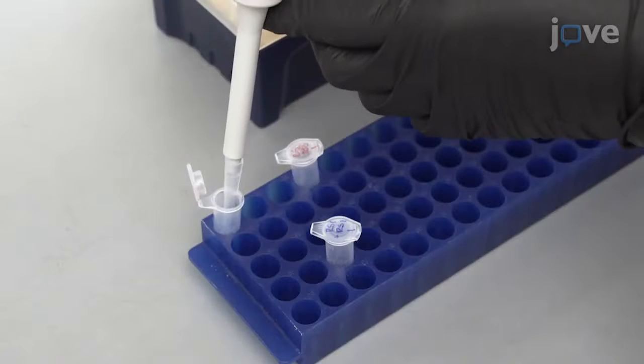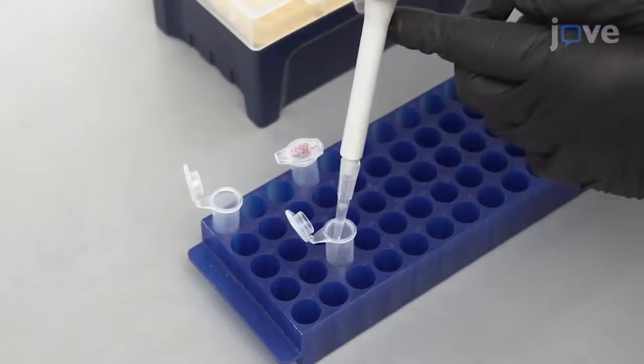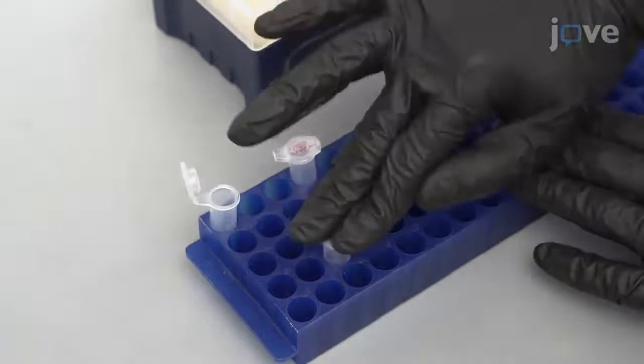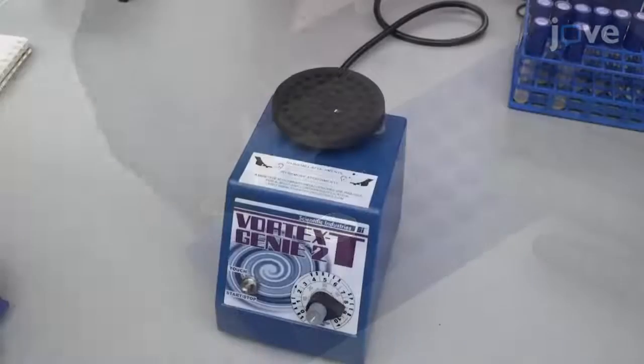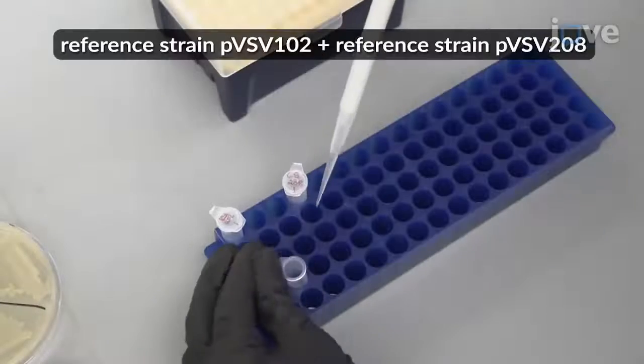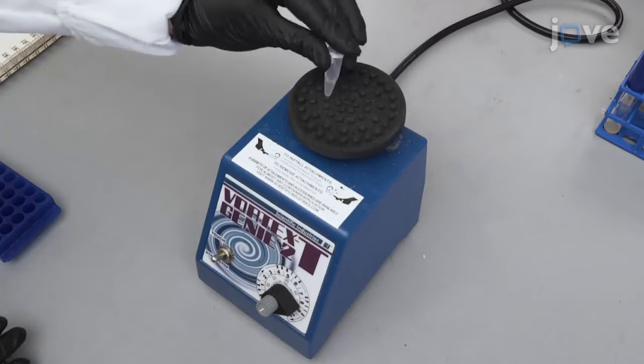To mix the reference strain and competitor strain in a 1-to-1 ratio, add 100 microliters of each strain normalized to OD 1.0 to a labeled 1.5 milliliter centrifuge tube, and vortex for 1 to 2 seconds. As a control, mix the reference strain with a differentially tagged version of itself, and vortex as well.